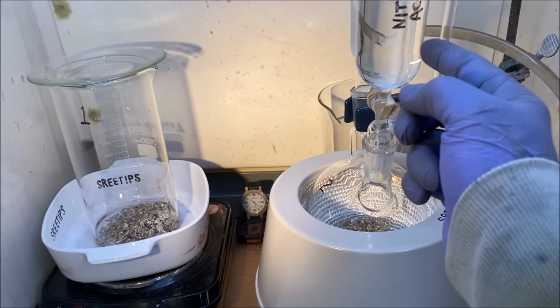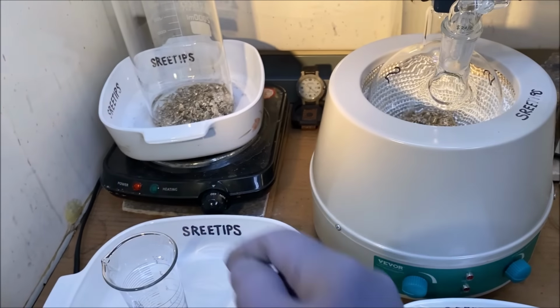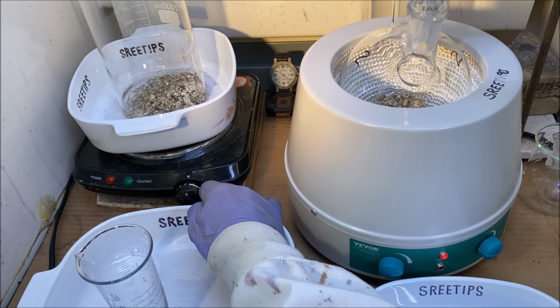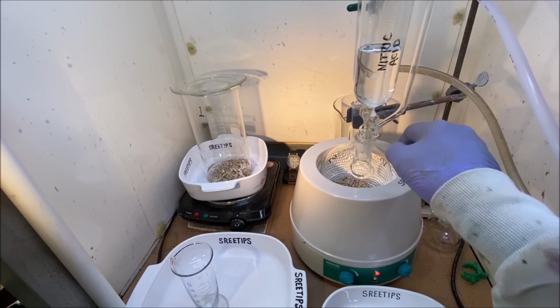We've got 100 milliliters of nitric acid up here. And we'll measure out another 100 in here and add it to this. But for right now, what we're gonna do is add a little bit of heat to each one. We're gonna start dripping the nitric into our reaction down here, a little bit at a time.